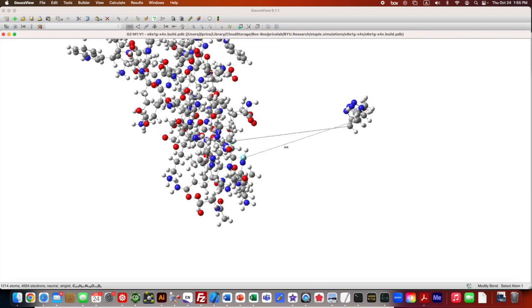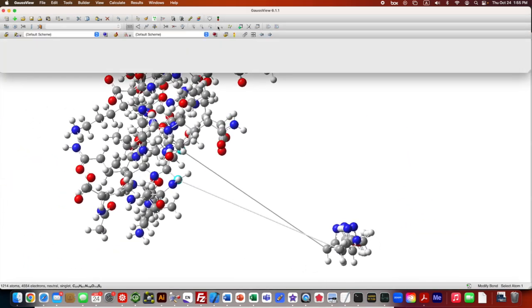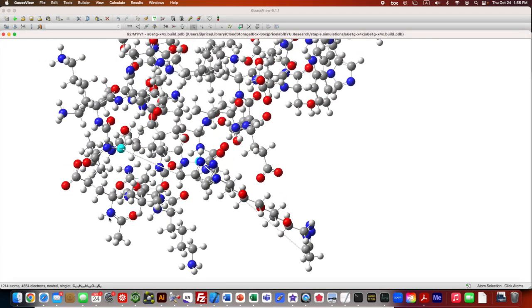The other thing it's going to do is go through and change bond angles to meet what it expects for an idealized sp3 carbon versus an sp2 carbon versus an sp3 nitrogen. And unfortunately, if you look at the amide bonds in our structure, this is annoying, and I don't know what to do about this, but I haven't found a solution to it. If you look at the amide bonds in our structure, there are some of them, like this one.